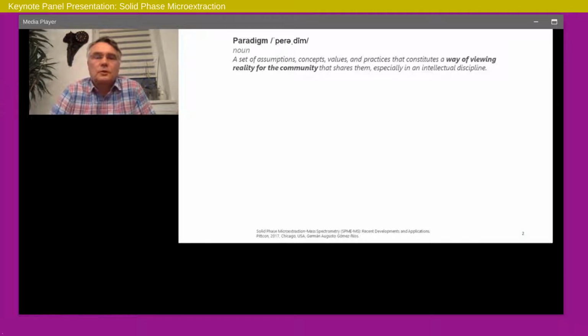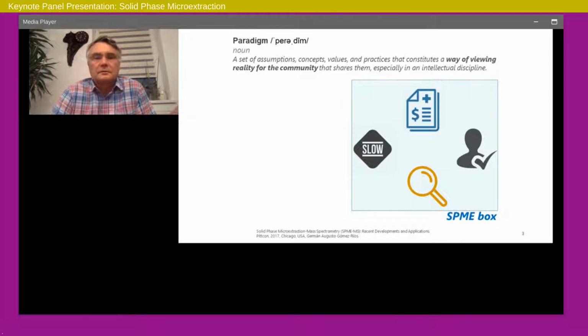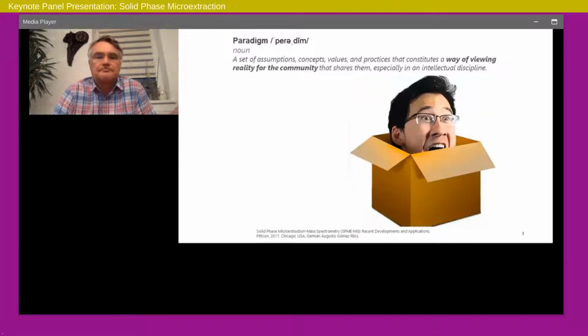So when you look at this presentation, you need to have an open mind, because we'll be changing the paradigm of the present way of doing analytical chemistry, specifically sample preparation. So I will try to explain something which might look difficult to you. In this case, solid phase microextraction, which you might not practice every day, and therefore it looks difficult. But I will try to make it as simple as possible. I'll point out the opportunity to improve the understanding of the technology by further courses or papers.